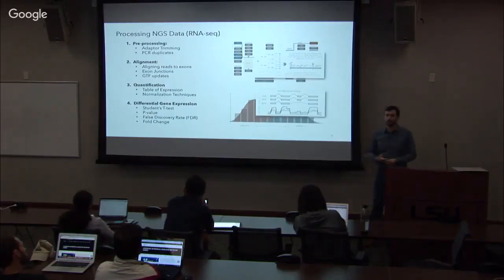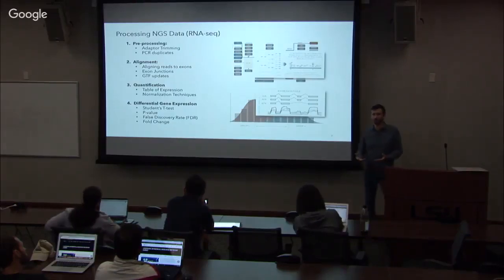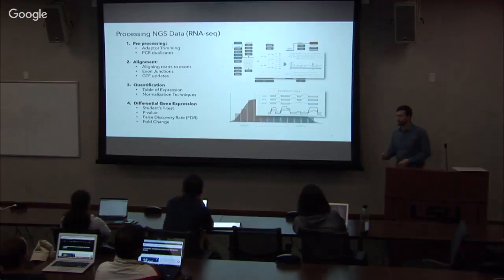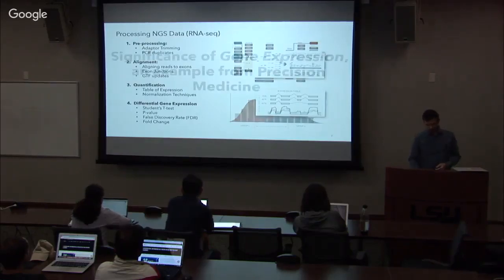Alignment, and which files are we using for alignment? What is the reference genome? What is the GTF file? So an understanding of all of those things. Quantification, how do we measure? What are some methods of measuring the gene expression levels? And then differential gene expression.